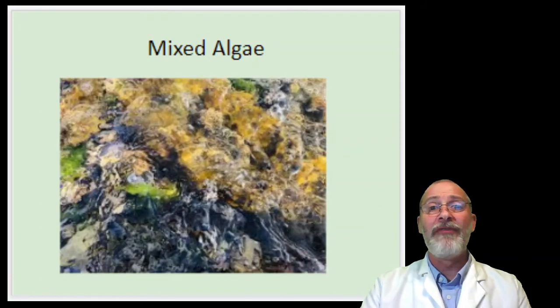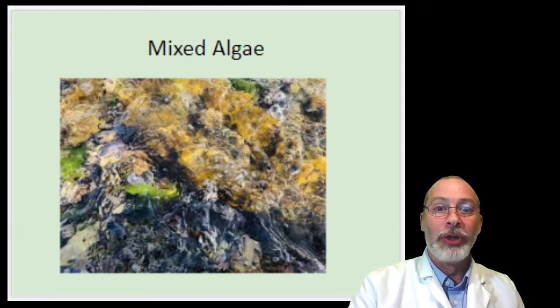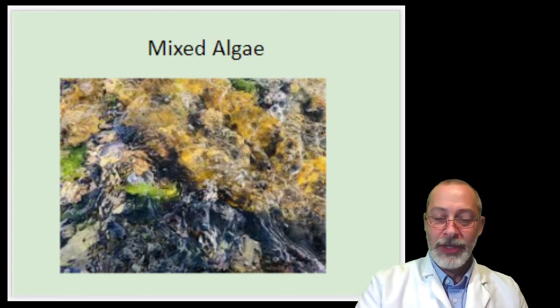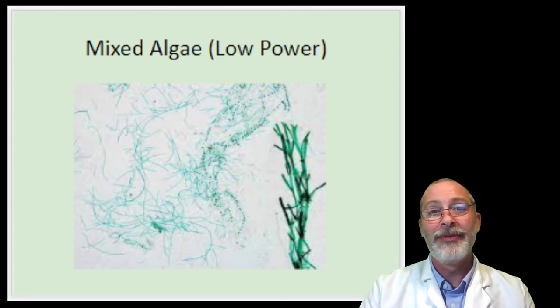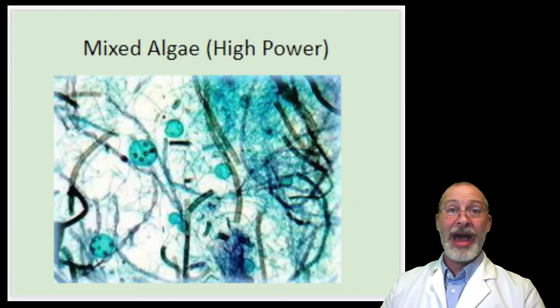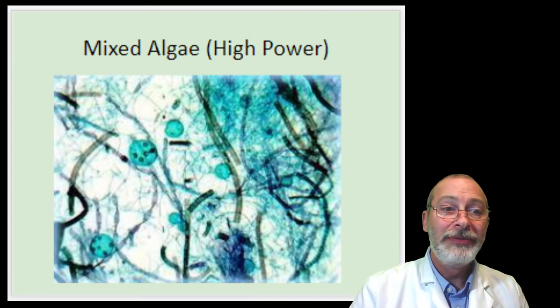And finally, we have mixed algae. We've got mixed algae, a little assortment of a lot of different things. And here we have some mixed algae under low power magnification. A little bit tough to see. The light is rather bright, but pause the video and make your observations. And finally, here's mixed algae under high power magnification. Pause the video and make your observations.